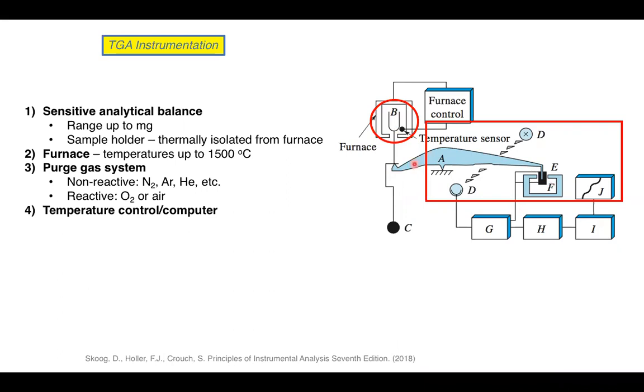Because what happens here is that this sort of beam moves up and down, and it will cut this laser between the 2 points of D. What this does is it looks to see how much of the light is actually cut out, so that it can check minuscule changes in masses. Depending on how much of this is cut out, we know whether or not we need to start recording. So it's measured in two ways: by this laser being cut in the beam, and by this, which is just a regular balance rate. Then this feeds back into our computerized system, and we get a readout of some sort, which looks like the one on the previous slide.